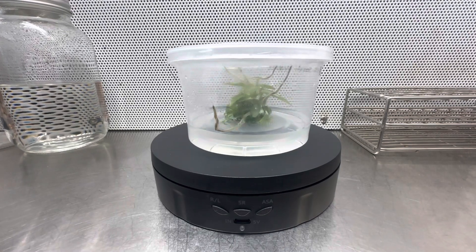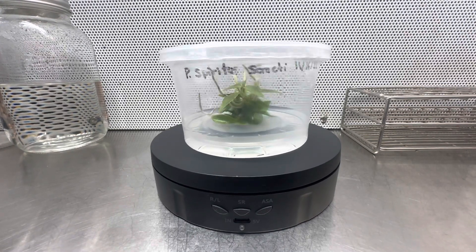This is Philodendron Spirosanti about to be moved to a biocoupler for faster multiplication.